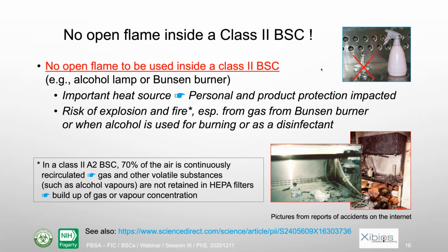That means that at some time you might reach the ignition point and it might just blow in fire or explode. And this has been the cause of a number of accidents in laboratories a bit everywhere in the world. If you look on the internet, you will see pictures like this. I also put there a reference to an article about an accident that happened with a student in Iraq. This can be a very dangerous situation for the people who are working there. In this case, the glass window was blown away, so the people could be hurt, and sometimes it can really destroy lives. So never use a source of flame or fire inside of a biosafety cabinet.